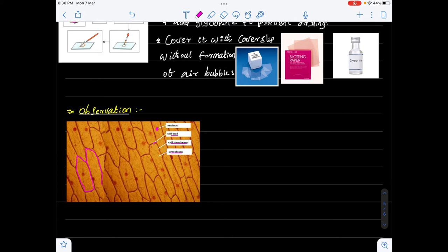There is a centrally located vacuole present in the cell. Due to the presence of this central vacuole in mature plant cells, the nucleus is pushed towards the cell membrane. Around 50 to 90 percent of the cell's volume is occupied by the vacuoles in mature plant cells. All these onion peel cells appear in a rectangular shape — regularly arranged rectangular compartments with rigid cell walls are visible.